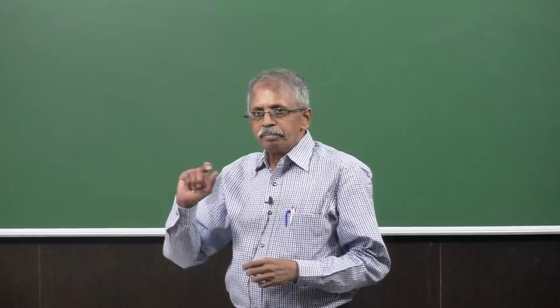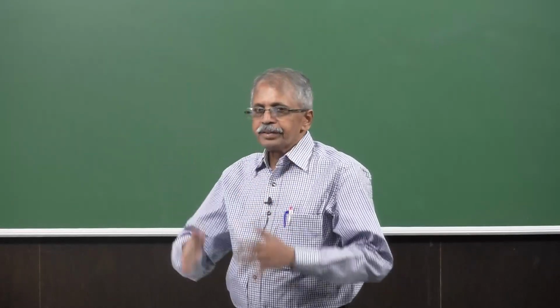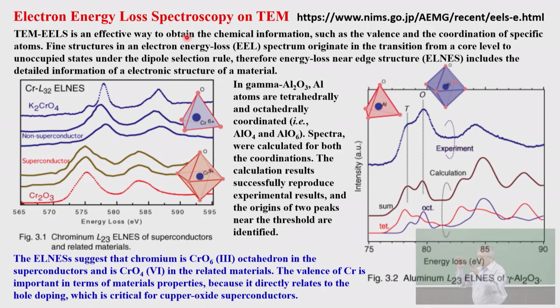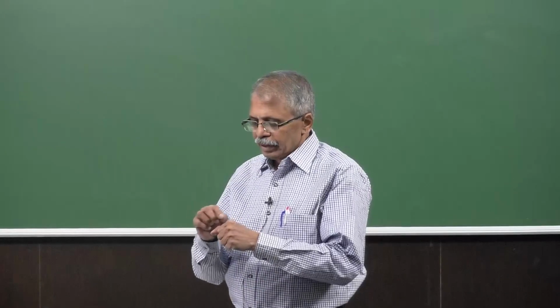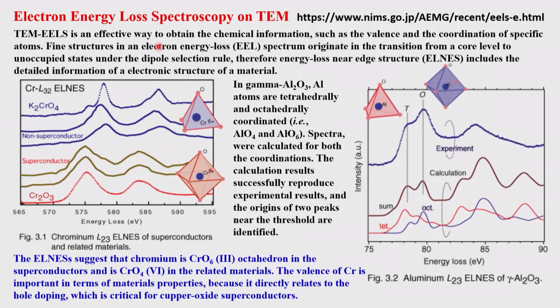Again, by making some modification, by tuning a little bit the configuration that I showed, you can measure a huge variety of things, and this particular technique is very sensitive to the central atom and what is coordinated to it. That means the coordination spheres, the nature and extent of the electron density, and the bonding. That is what you can study here.